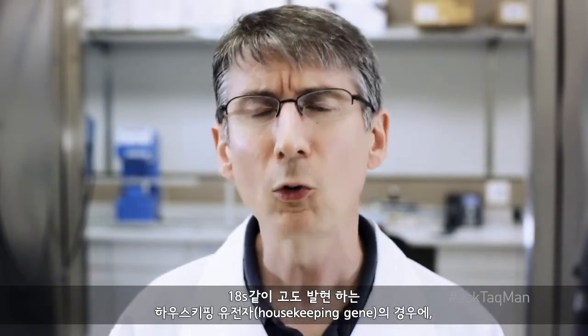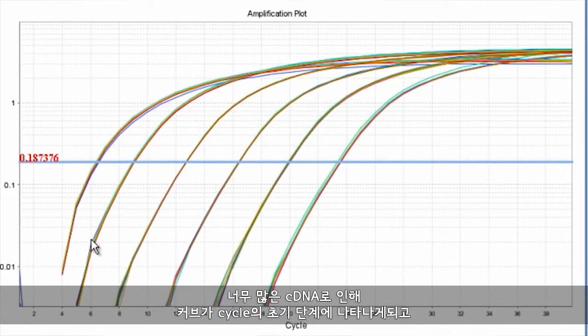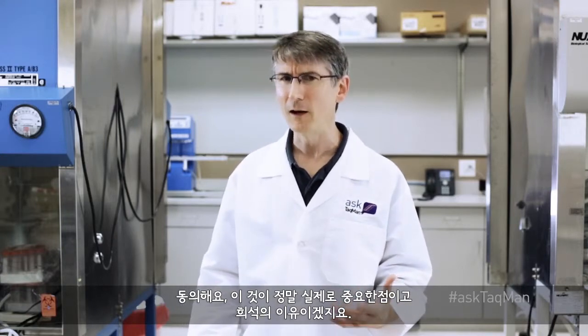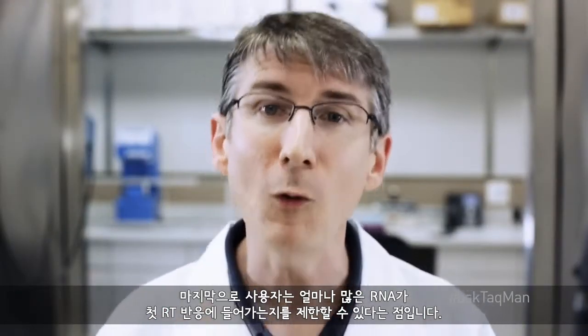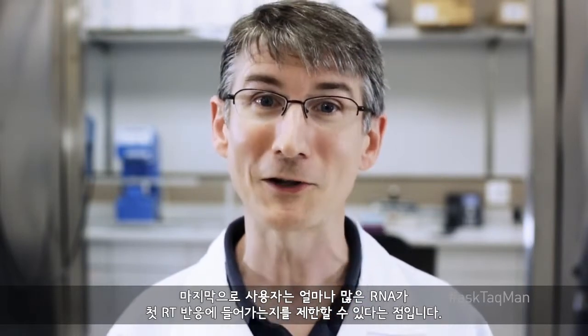There is a second reason people dilute cDNA: the fear that too much cDNA will cause the housekeeping gene, especially if it's a very high expressor like 18S, to appear so early during cycling that an accurate baseline can't be set. This is a real concern and probably a good reason for diluting. Just be sure not to dilute so much that your target gene CTs drift into the mid-30s or later, since this can cause problems of its own.